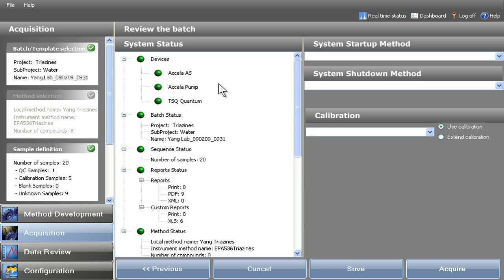TraceFinder guides users through each step, ensuring fast and reliable sample analysis.